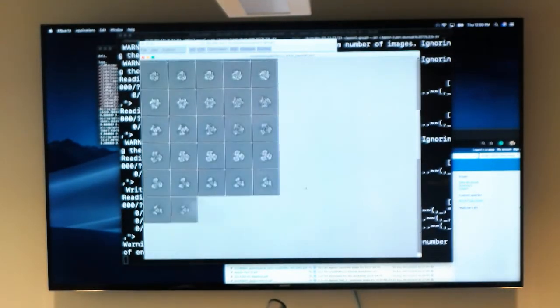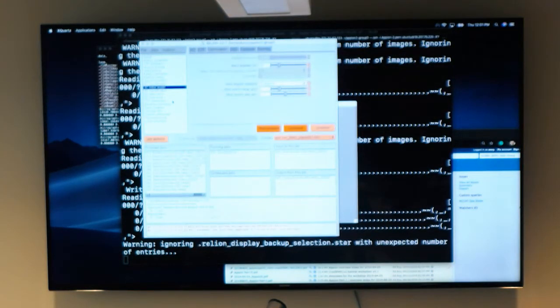Even in this initial model, you can see secondary structure, and you can see the symmetry imposed. So every time you generate anything in 3D, I would recommend viewing it in a 3D viewer. Despite you asking the program to do something, it'll do what you tell it to, but it may not give you an interpretable result just because of certain parameters.